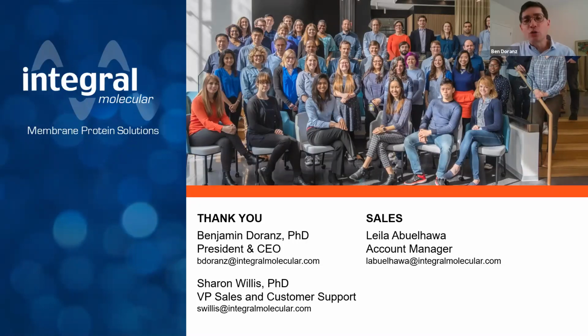Yeah, so each tube is 1 mil aliquot, and from our tests, 1 mil is about right for 1 plate. So 96 well plate or 384 well plate, depending on how your assays are set up. We have some recommended volumes for each of the RVPs that get sent out in terms of what we would start out. Of course, we recommend you also do some dilution curves if you like to optimize things yourself, but each tube is basically designed for one plate.